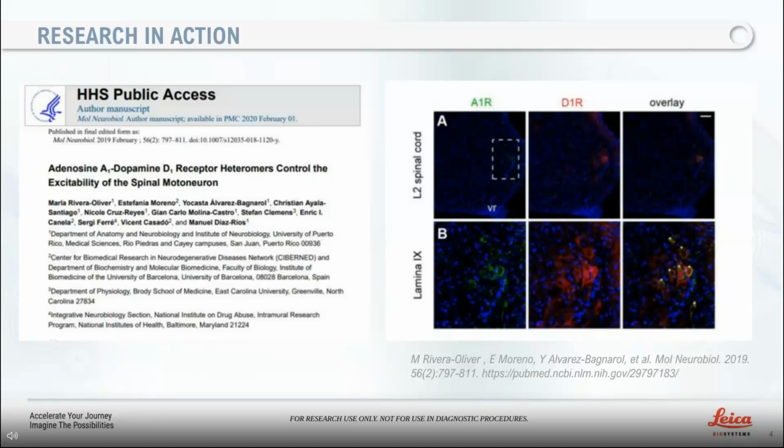To understand the anatomy and cell-to-cell interactions, I perform immunohistochemistry and other assays on previously sectioned tissue from the cryostat and the vibratome. The cryostat was key to achieving the thickness and quality of the tissue I needed and preserving its antigenicity. Cryosectioning was the best solution as it was a fast and reliable way to get a tissue ready for staining, and the imaging quality was superior to any other technique I tried.